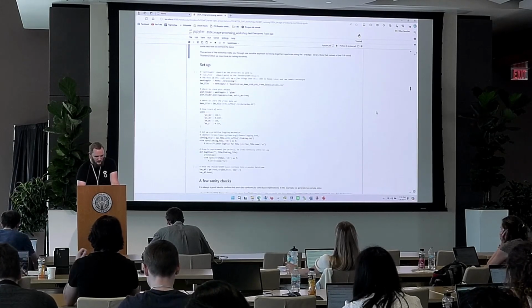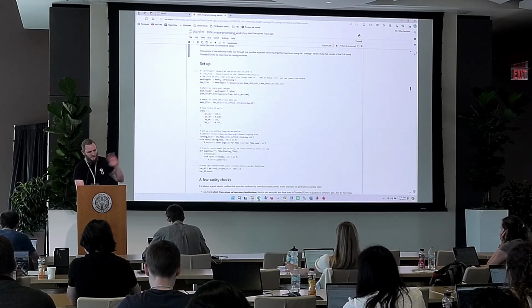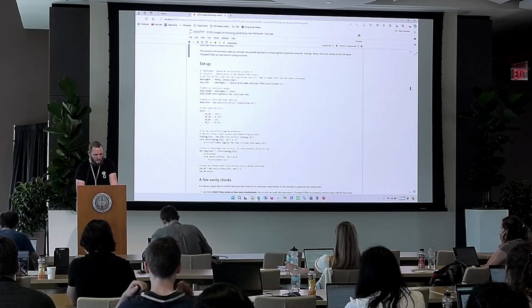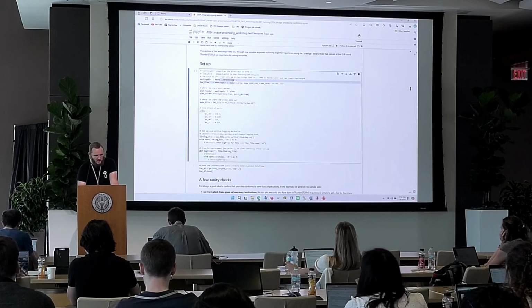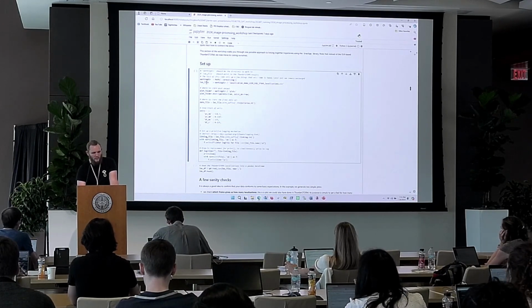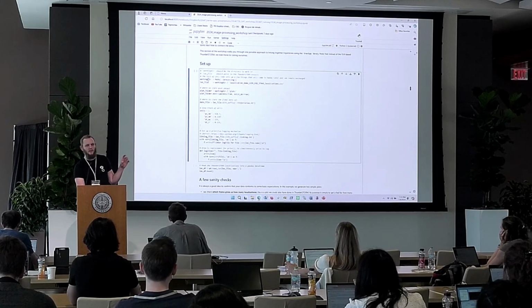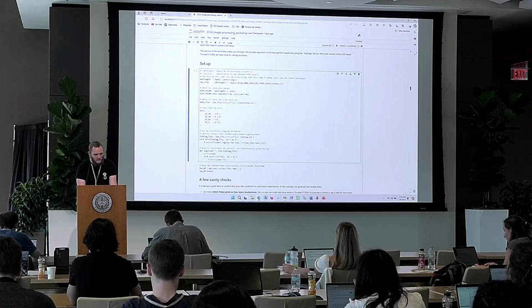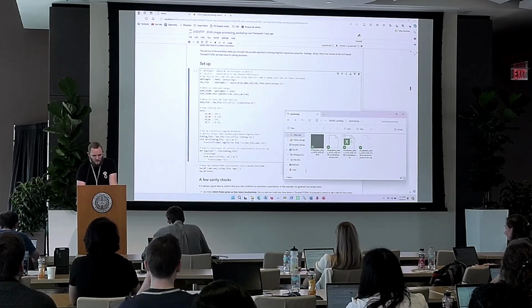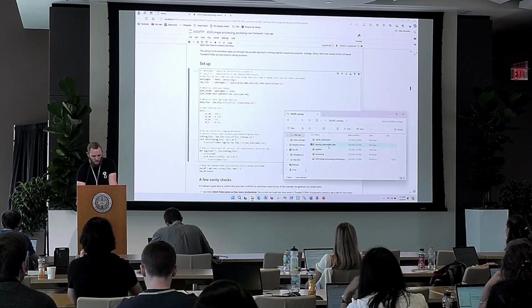Let's start by setting up the environment. This code cell is just setting up some variables that we're going to use throughout the rest. It's not that important. The thing to get right is this: we need to know where the file is that we want to load the localizations from, and we also need a directory where we can store output and all those things. The way I set this up on my machine is I have this folder called processing. Here there's this backup folder, for example.